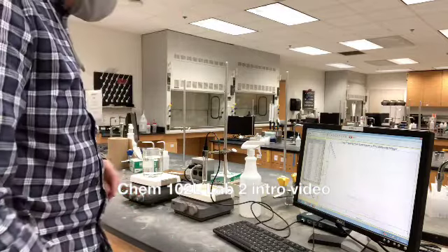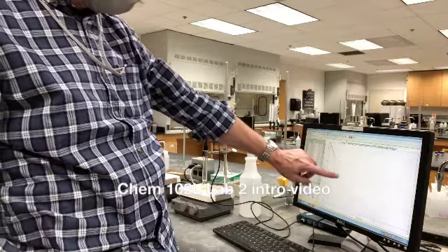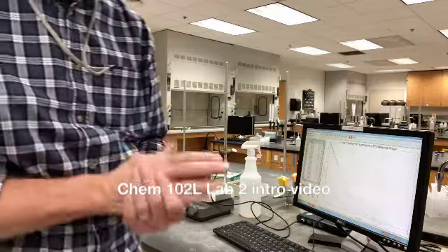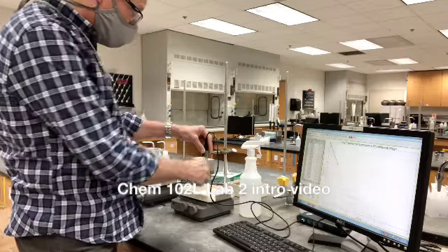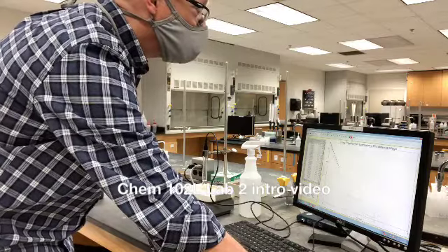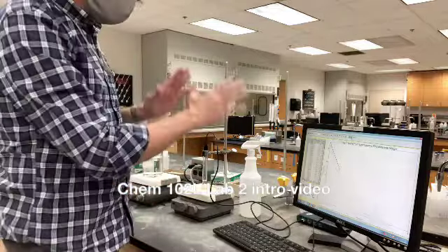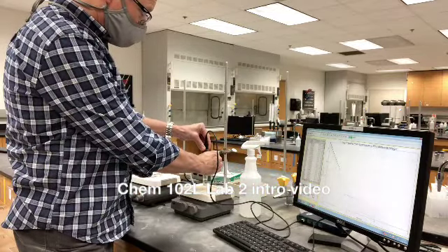So I'm going to probably stop this. It's going to keep going down, and we're going to look for a chance where we get this inflection point, and that inflection point is going to be where we can identify the freezing point for pure lauric acid. Now, when we're done getting this freezing point, let's just stop it now. You probably want to see it all the way, but I'm going to stop it. What I want to show you is how to measure now making a mixture. So that's the process of going through to find a freezing point for this.